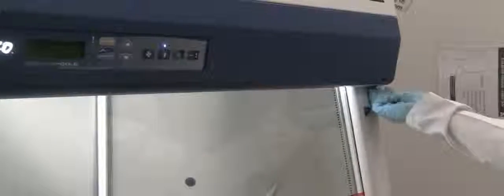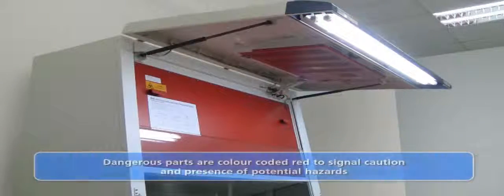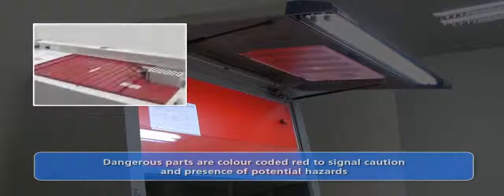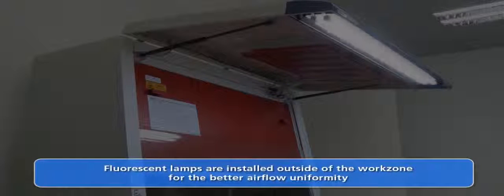The front surface panel provides service access to cabinet modules and is easily opened by removing the screws on both sides. Parts that are potentially contaminated and hazardous, such as the blower plenum or the electronic selectable module, are color coded red to advise caution. Fluorescent lamps are installed outside the work area to minimize obstruction to the downflow air in the work zone, and this design also ensures that the light is not shining directly toward the operator.